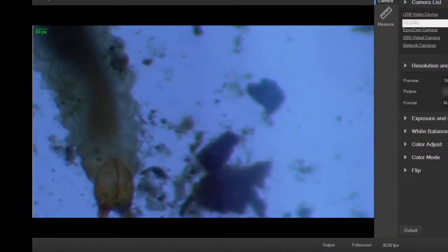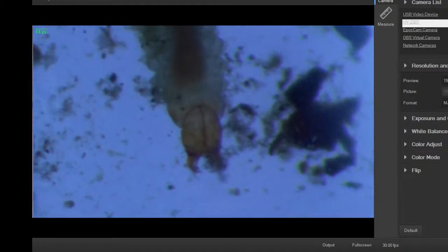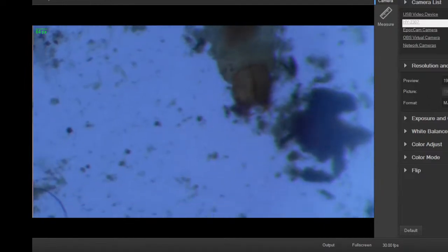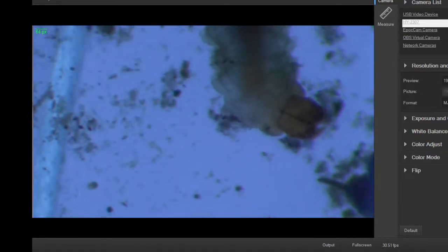Much of that debris from the mouth parts there. Yeah, that's cool. Look at that. Oh, it's still moving, so it's not dead. This might be a larval pincher bug. Earwig. Look at that.